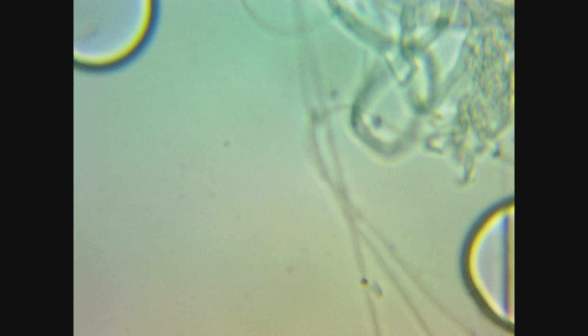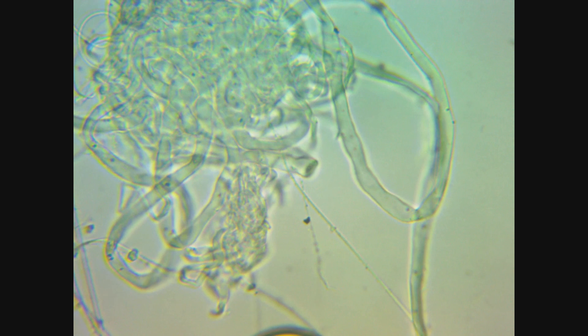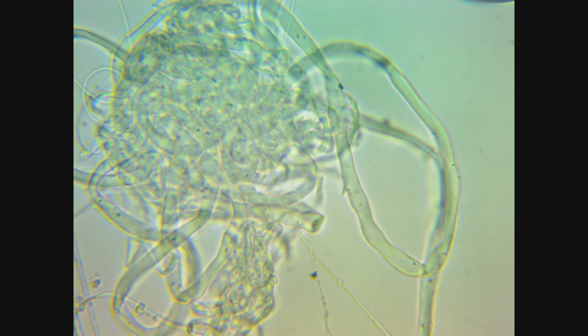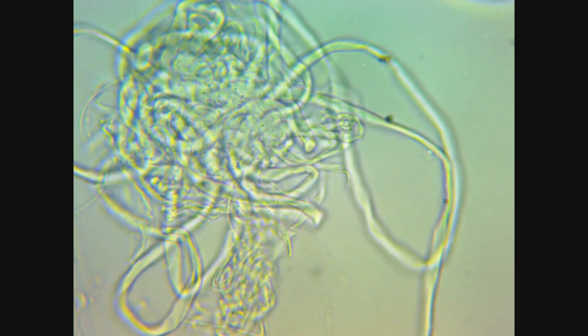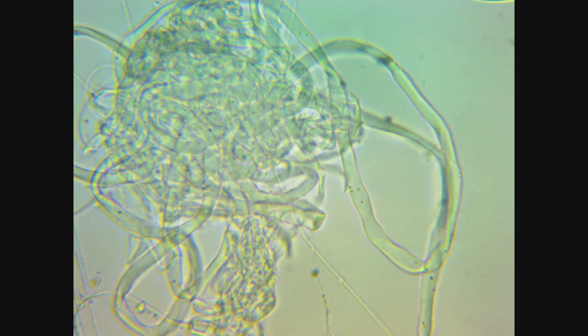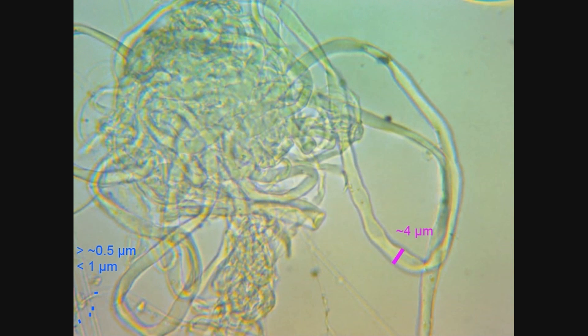We can see here, under the finest magnification of the microscope, a big ball of spiderweb here, where all of the web has relaxed into a knot. It's not stretched here anywhere. And you can see it's quite expanded, quite thick. It's about 4 micrometers. It might actually be a little bit bigger than that. And the smaller strands are on the order of a half a micrometer to a micrometer. This range of sizes is quite common for most spiders of all sorts.